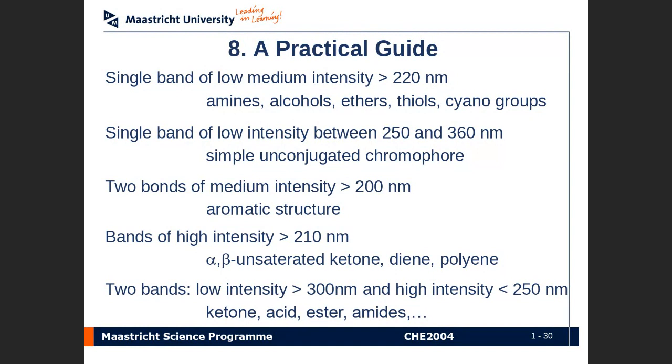So this is actually quite useful. Maybe I was a little bit unfair to this technique a moment ago. It is useful, and you can use it in combination with other spectroscopic methods to hint at what sort of functional groups are present if you use the simple guide. But of course, it's not going to tell you much more beyond that, okay? But it's important in the overall grander scheme of things.